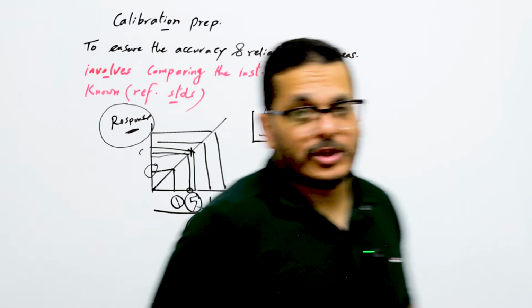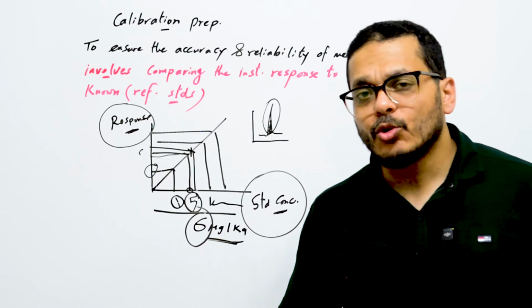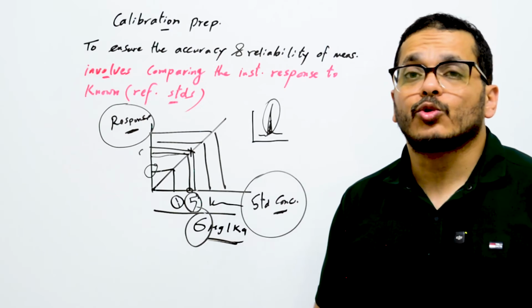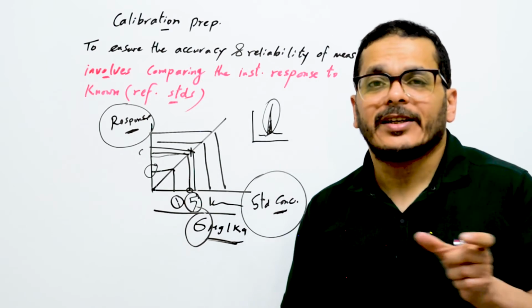So it is very important to prepare your standard concentrations in a very good way without any mistake, because any mistake in calibration standard preparation will also affect the reliability or accuracy of sample results.